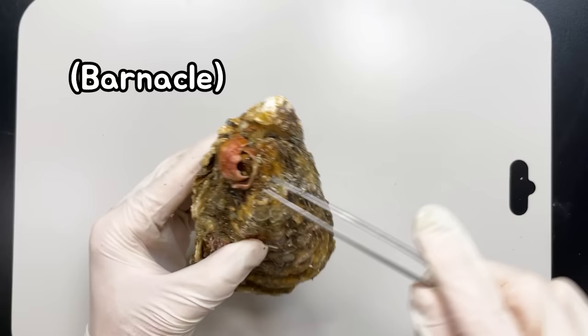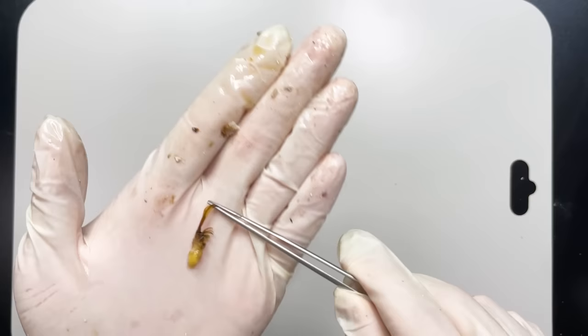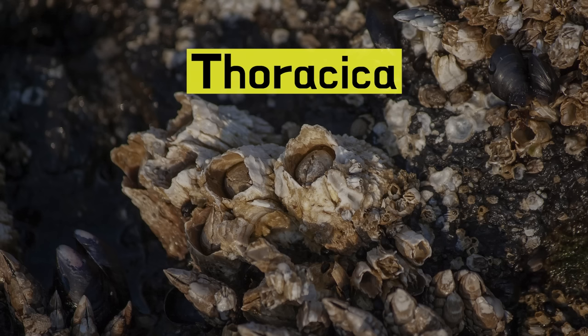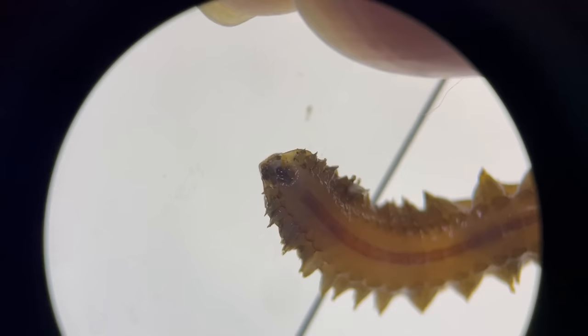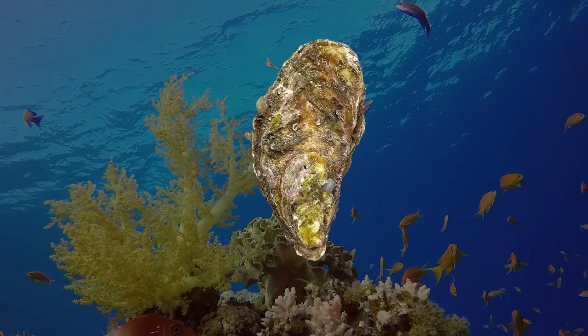If you take a quick look at the creatures that have been discovered, this is the inside of a barnacle. And you can see something like the gooseneck barnacle that I've showed you in the previous video. This is because barnacles are thoracica, like gooseneck barnacle. And I zoomed in on this strange creature under a microscope. And it's alive. This creature is the scale worm and annelida. And this is the head and mouth. In addition, there are numerous creatures living in oysters, including sea grass, sponges, sea anemone, and crustacea.